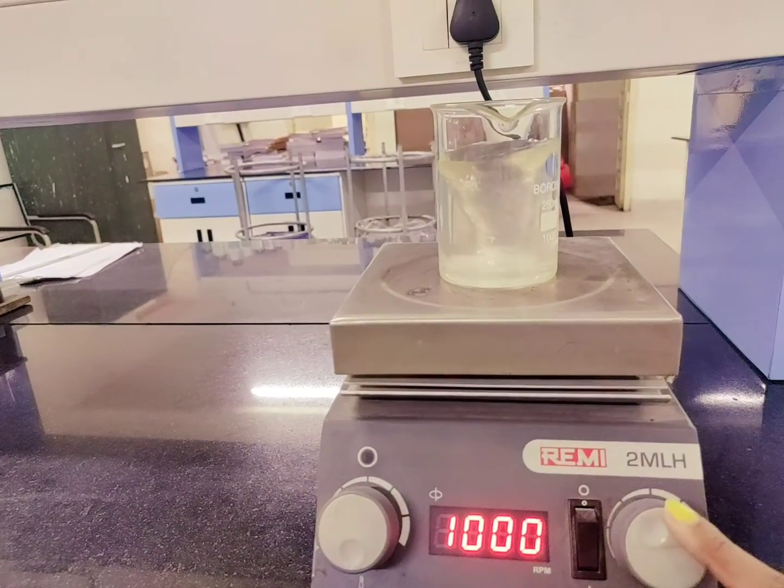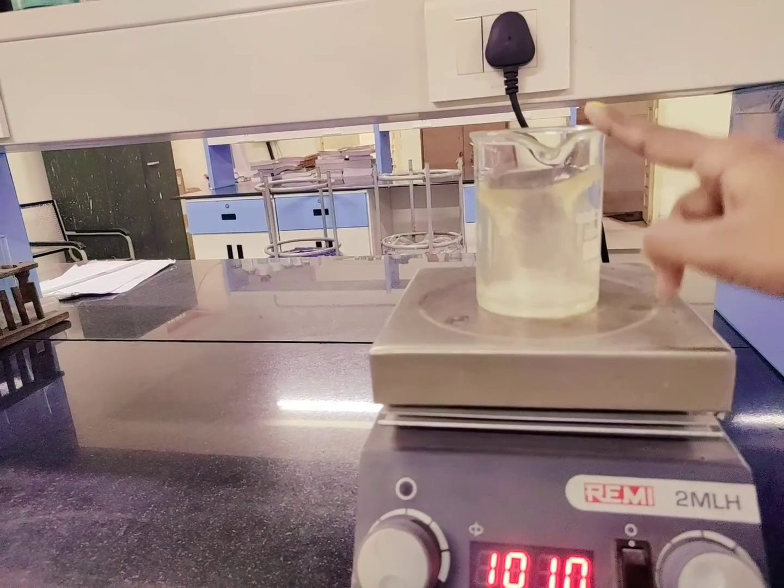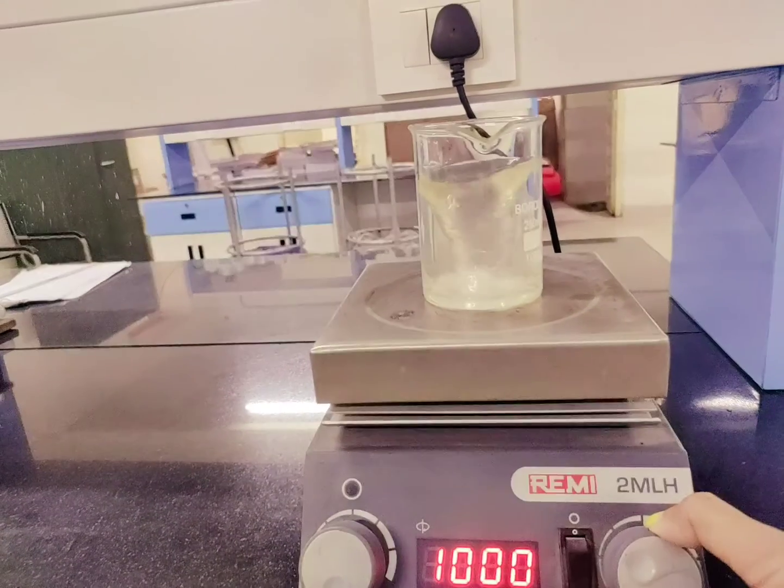We have to make sure that if you are increasing the speed, you consider the size of the beaker, because otherwise your solvent or the sample that you have kept in might spill out.